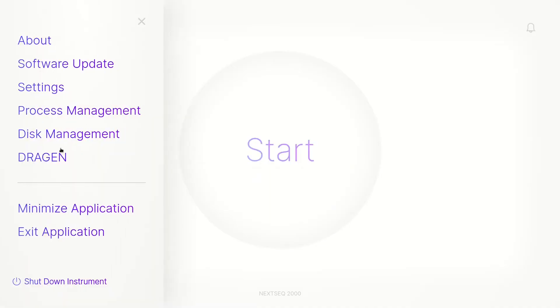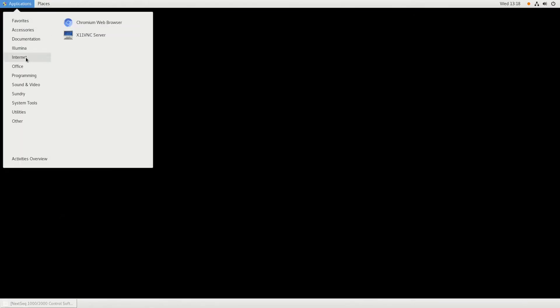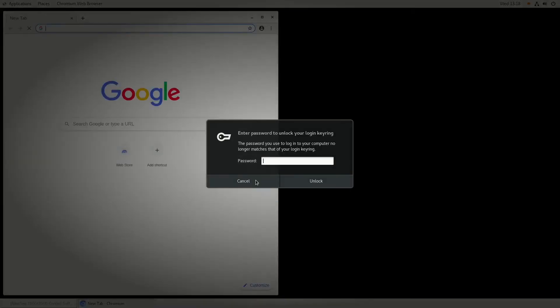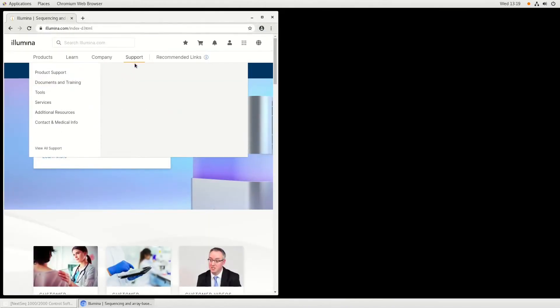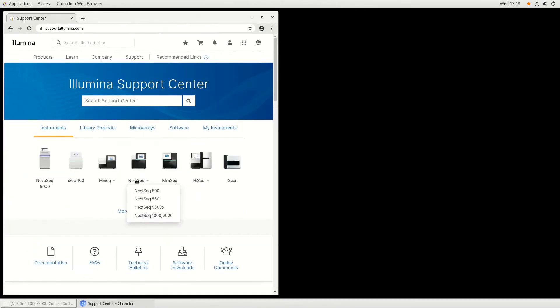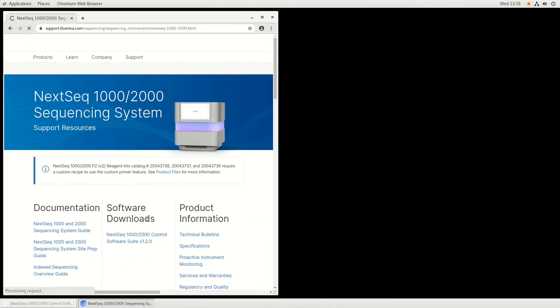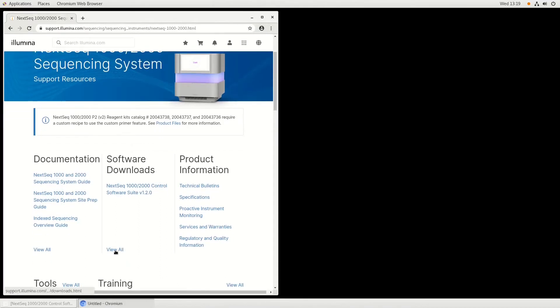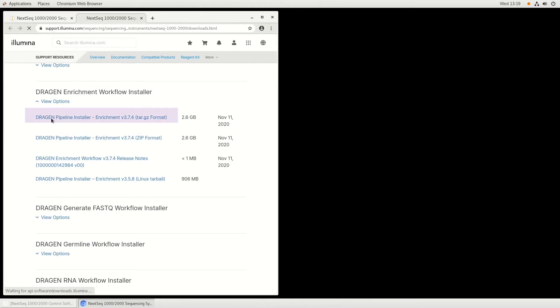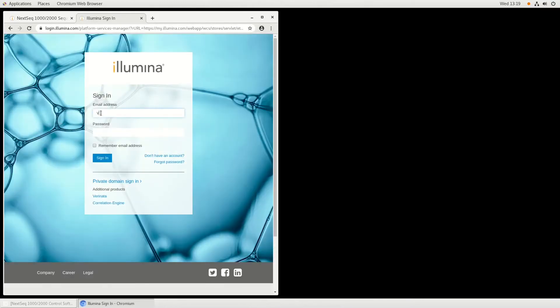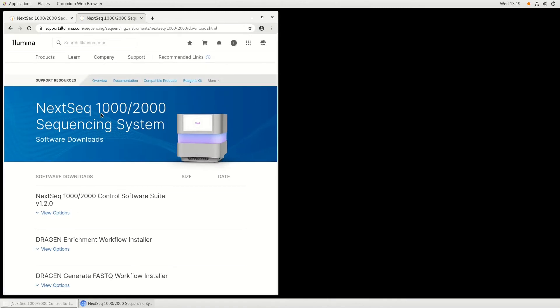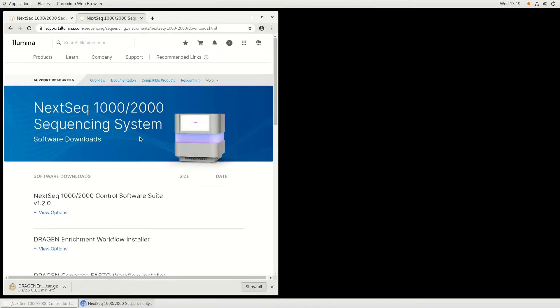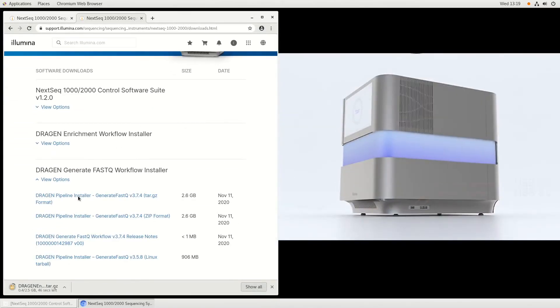Either on the instrument or a separate PC, open the Chromium browser. If a dialog box opens, select Cancel and navigate to Illumina.com. Select the Support tab, followed by Product Support and Instrument Support. Select the down arrow next to NextSeq and choose the NextSeq 1000 and 2000. Under Software Downloads, choose View All and select the Most Recent Software Suite .tar.gz file for each installer. At the login screen, use your My Illumina or BaseSpace credentials to proceed with the download. If using a separate PC, download the files to a local or portable drive. If you saved the installers to a portable drive, plug the drive into a USB port located on both the side and back of the instrument.